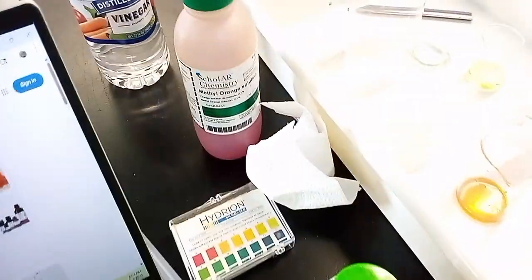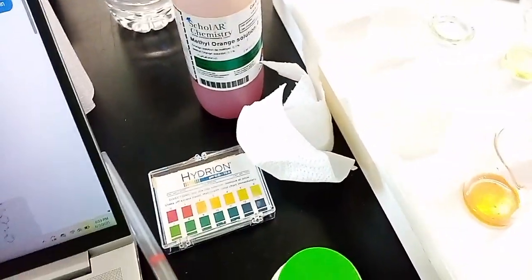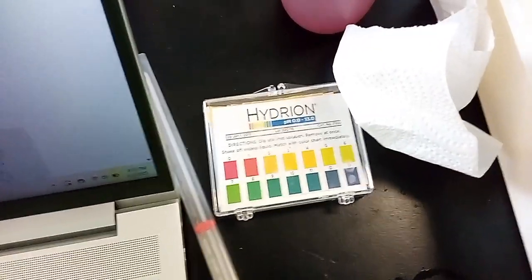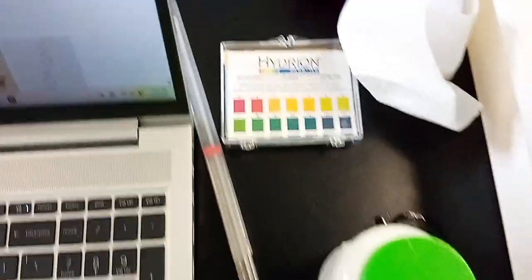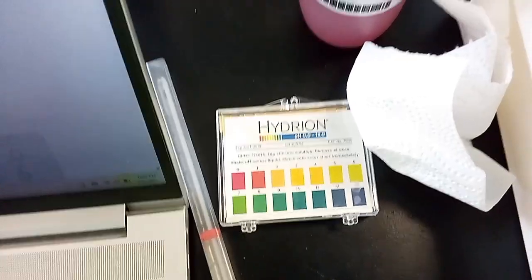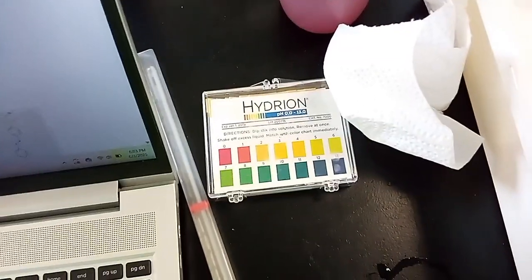Indicator solutions. I want to talk about indicator solutions that are used when we talk about acids and bases. Just like the pH strips, they change color. They tell us what the pH of the solution is. There's a quick method to determine the pH if you don't have a pH meter. There are indicators too. We have methyl orange.